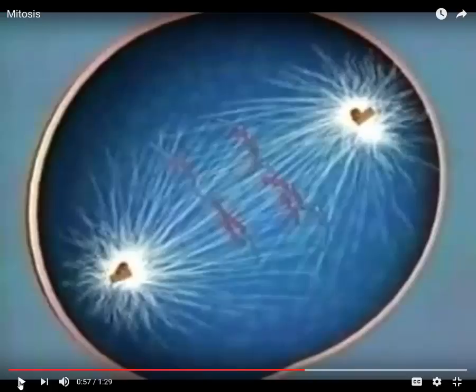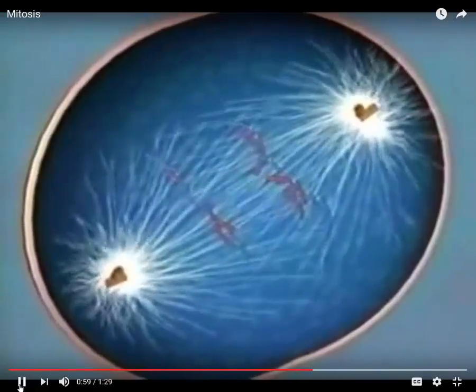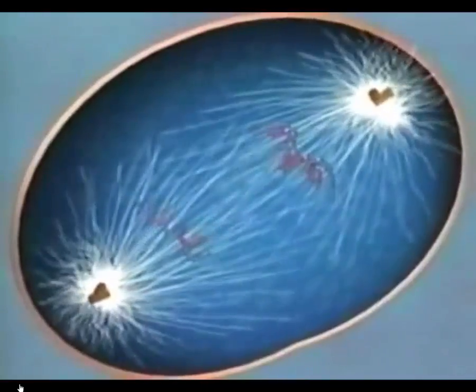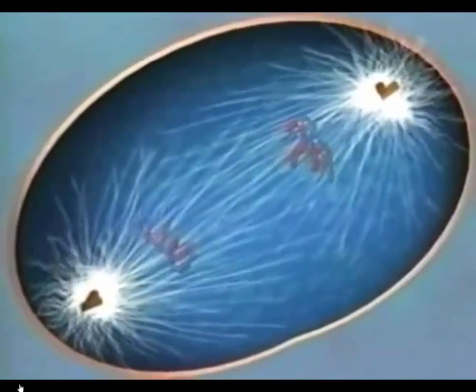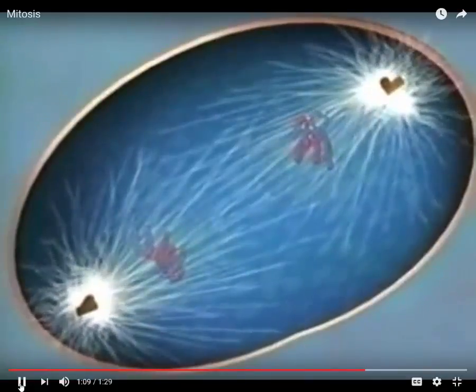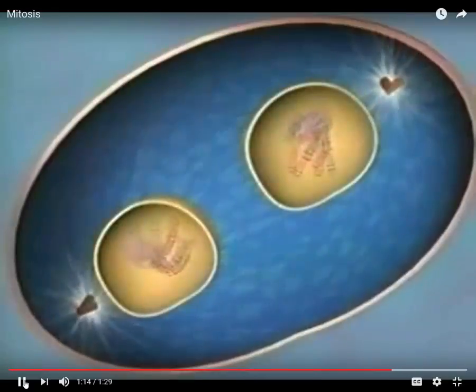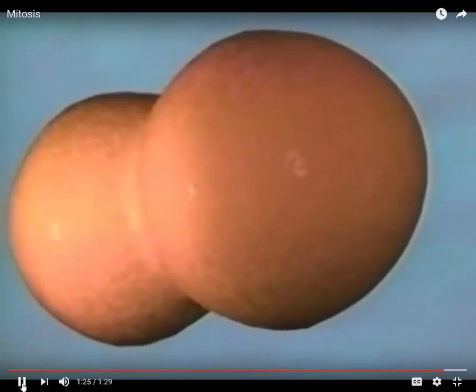For the lab exam, you're going to have to look at pictures or slides of the different phases of mitosis and be able to identify it. So it's a little bit of a review from general A&P. Not many questions, but a couple. Other spindles push against each other in a ratcheting action that stretches the cell. The chromosomes then unwind and the nuclear membranes reform. With mitosis complete, the nuclei and cytoplasm separate, creating 2 new cells in this ongoing cycle that sustains all life.